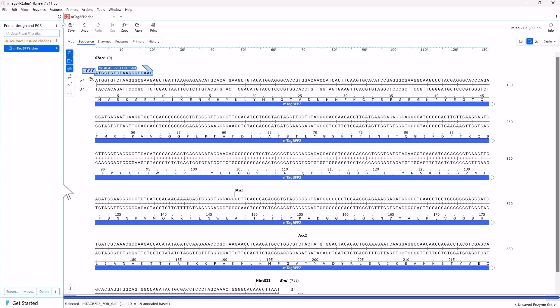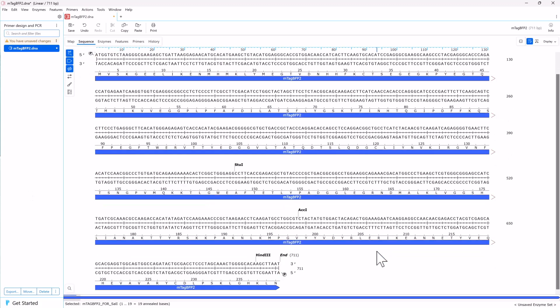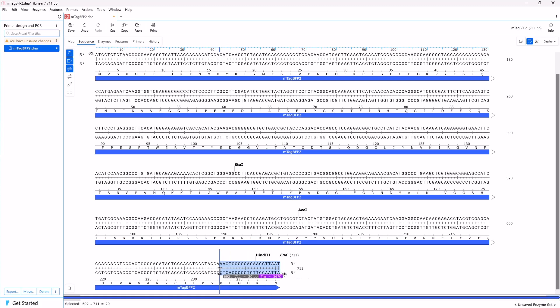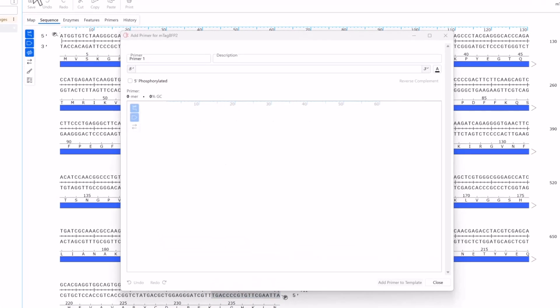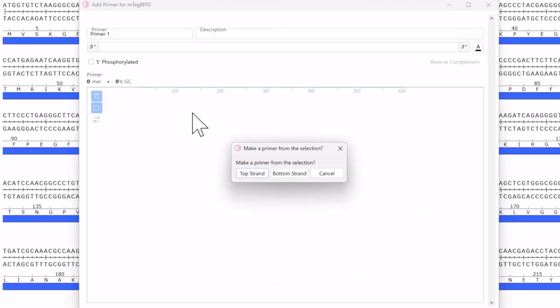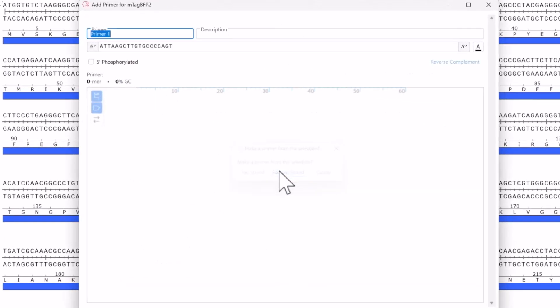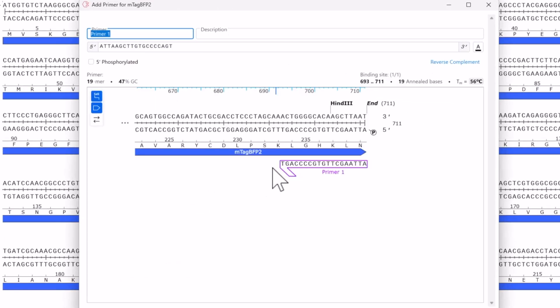Then repeat the process to design a reverse primer. Again, select a region to give a Tm of about 55 degrees. This time, choose bottom strand to create a reverse primer.